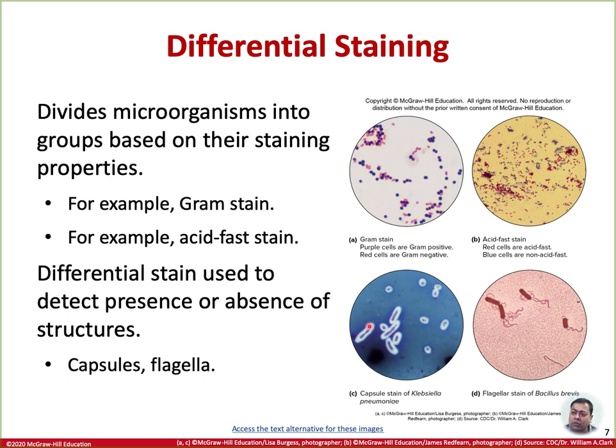So the rod-shaped structure that you are seeing inside the capsule is the bacteria stained by the basic dye, positively charged, and it is attaching to all the negative structures that bacteria and most cells contain. Remember that we already talked about how most of the proteins are negatively charged. The nucleic acids are negatively charged. So most of these cells are negatively charged, which is stained by the basic dye having a positive charge.